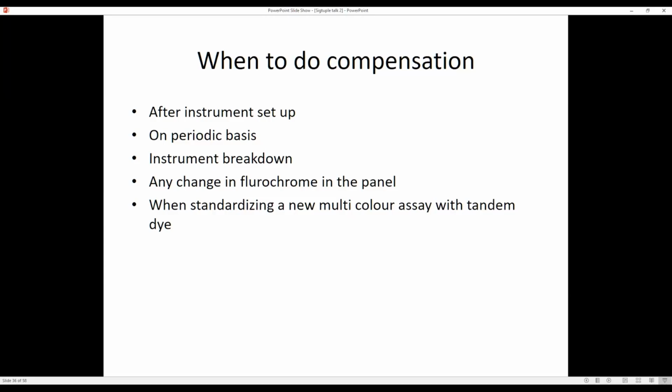I have a question here, please. Yes, doctor. So if I change the fluorochrome, I have to change the compensation. This is well understood. But I have to use the fluorochrome-specific compensation. Correct. For this specific combination. Yes, correct.